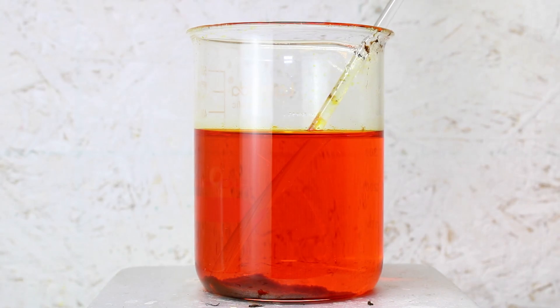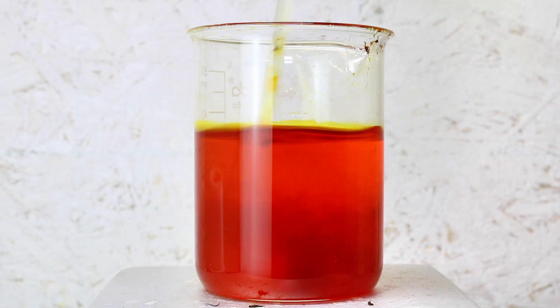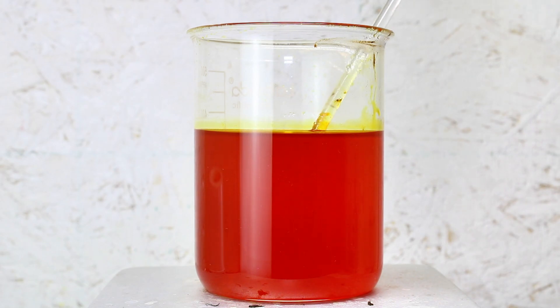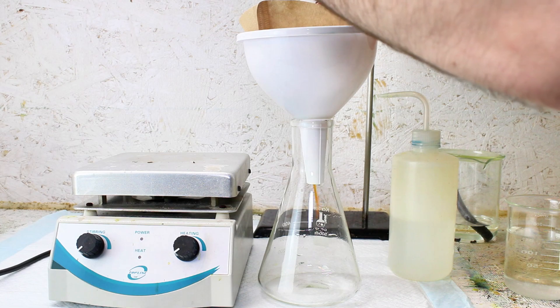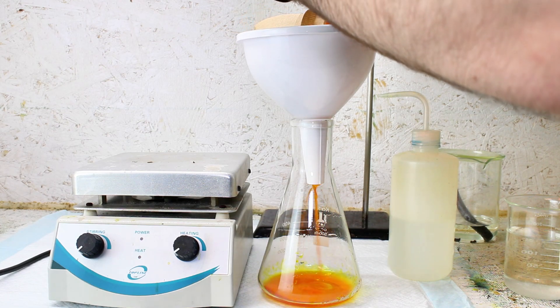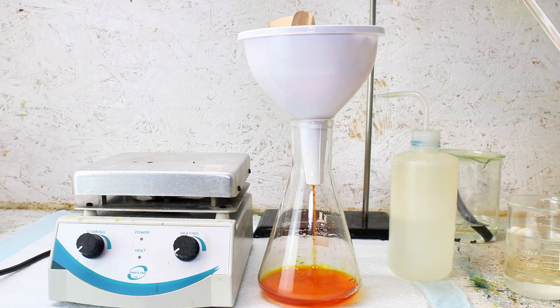I gently heated this mixture and gave it the occasional stir to help it along, but even after leaving it overnight and adding a decent excess of bleach, there was a bit of sediment at the bottom that refused to oxidize. I eventually gave up and went ahead and passed the solution through a filter again to remove this and leave a perfectly clear solution of dark orange dichromate.